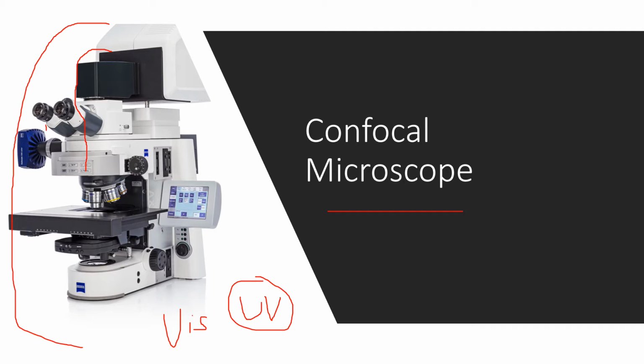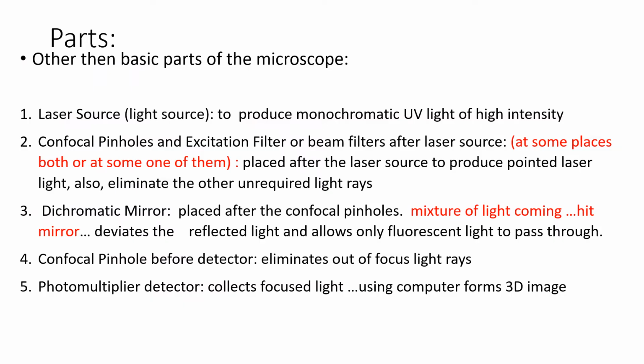And the second thing here you can see is a detector. We're going to talk about what these are and how these screens are also inserted in this microscope. So let's get started with it. Now we're going to talk about the parts. There's also a principle involved in this confocal microscope, but I will talk to you about the principle in another video, because if I talk about the principle in the initials it will not be clear, and I want you to learn about parts and working before talking to you about the principle.